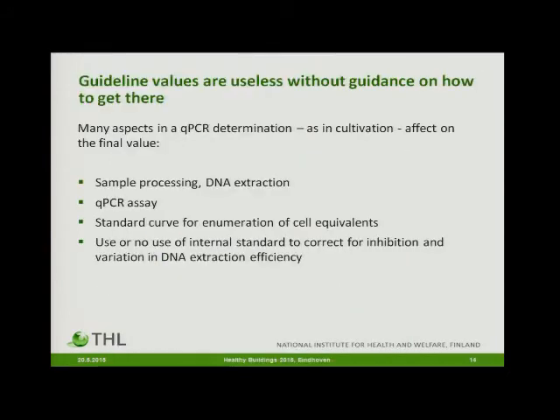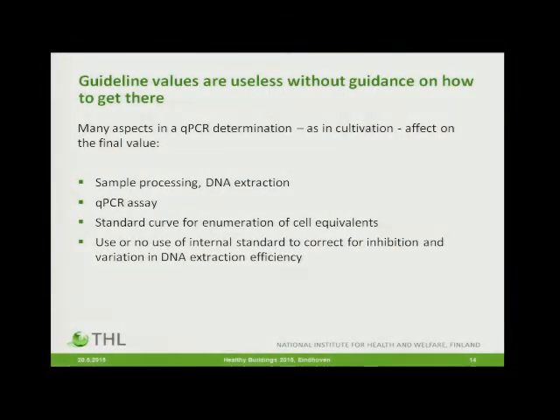Okay, last 3 minutes, maybe I'll try to make it. What I'd like to talk about is that, of course, it's rather obvious that guideline values are really useless if we don't tell people how to do it so that you get there. There are many aspects, like in any method, or in cultivation, that really matter in terms of your result in the qPCR.